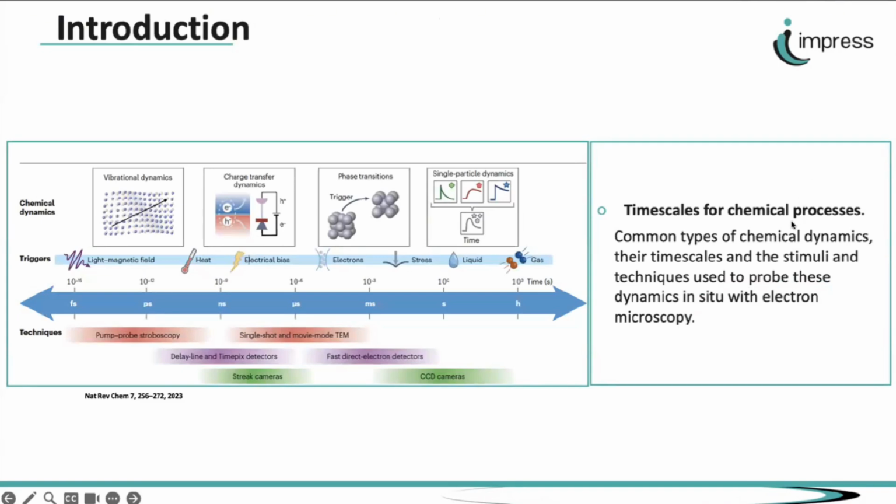There is a sample in a TEM, say in a steady state in ultra high vacuum condition, and then we apply a stimulus to the specimen and cause a change in the specimen condition. Depending on the condition and the reaction time, there are different time domains in which we need to observe the changes.